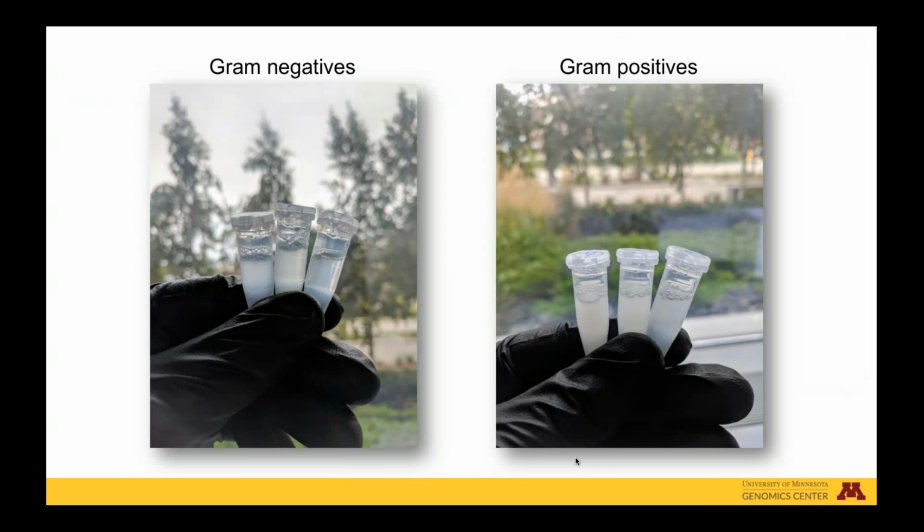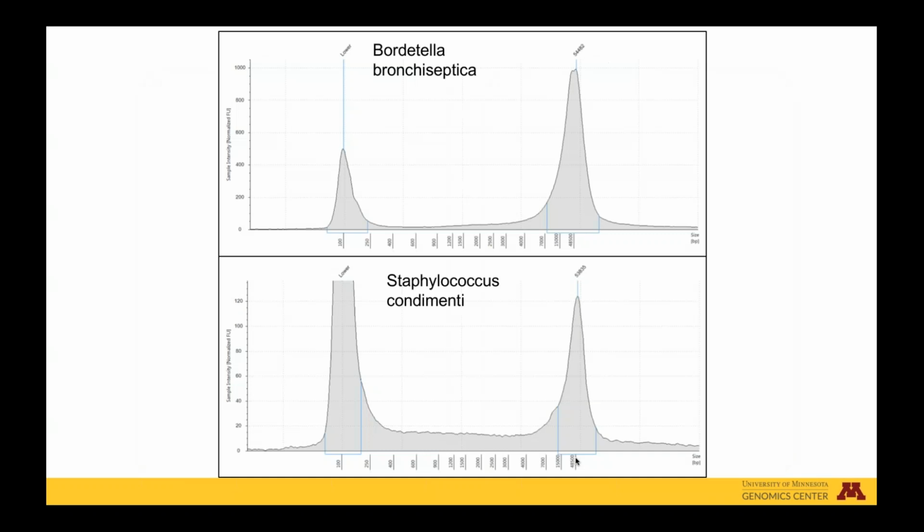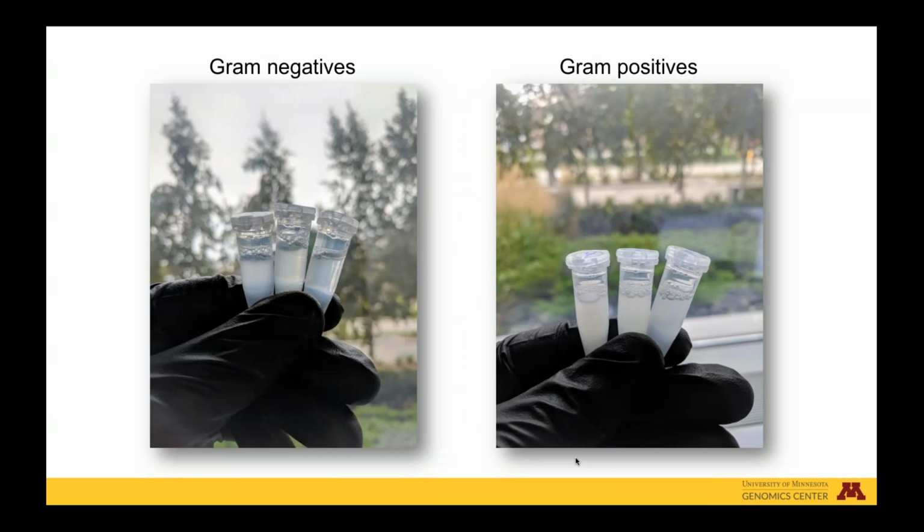And it's quite easy to tell visually that the lysis was not complete for many of these gram-positives. So, if you're working with isolates, that visual check can be a great indicator. One method we tried, which can assist in the lysis process and potentially improve your extraction efficiency, is the use of light bead beating. So if you're stuck, you might want to give that a try.